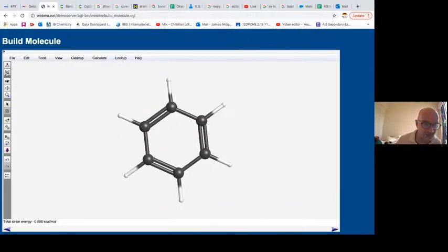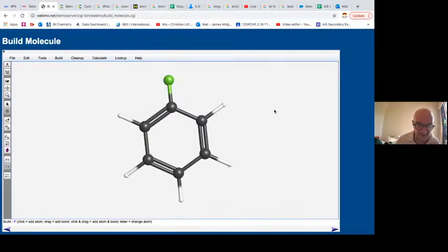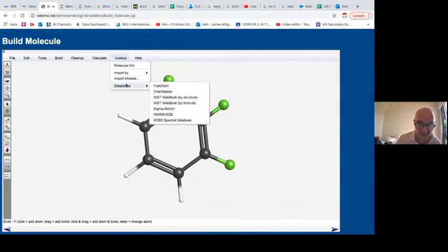Why is that good? Well, you're all thinking like me, aren't you? You're all thinking, what if I change that fluorine? What happens to the NMR spectrum? Or that hydrogen for fluorine? Or maybe if I put 2 fluorines, or 3, and so on, and so forth. And then all you do is look up, goes to the database.